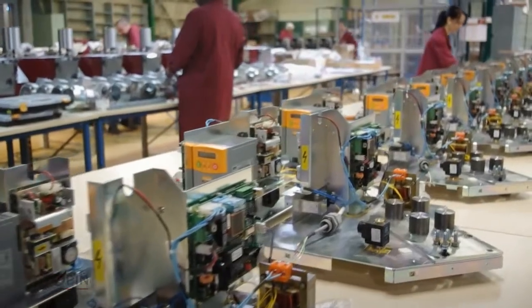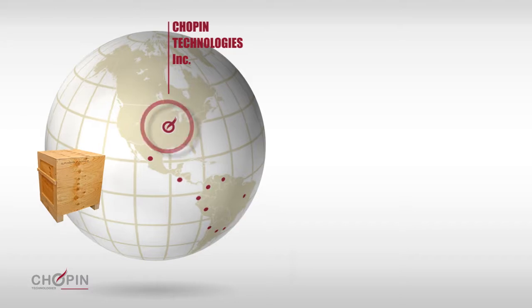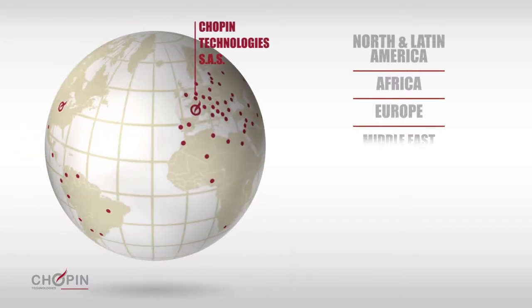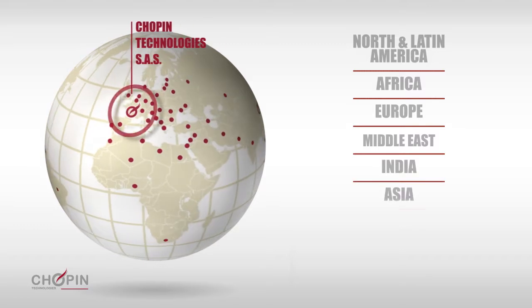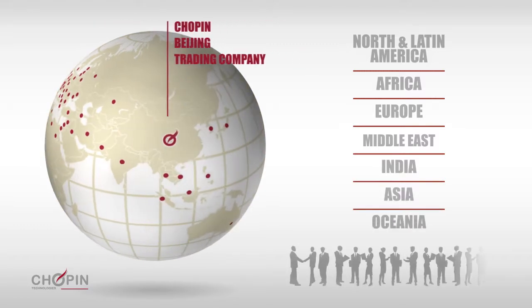Made in France, the AlveoLAB has a customer base in over 90 countries. All across the world, technicians are available to train users, carry out maintenance and support equipment, and provide a rapid response to ensure quality analysis.